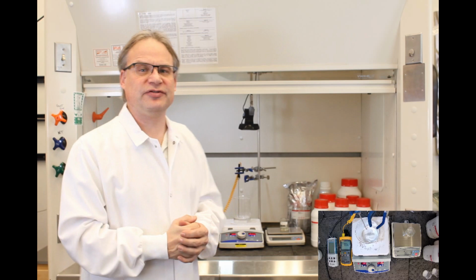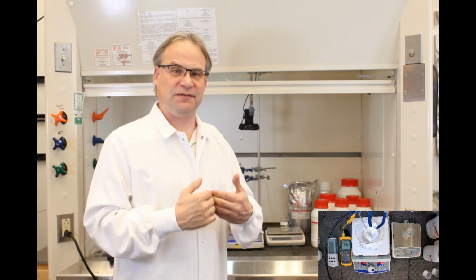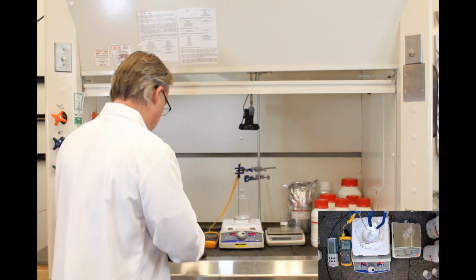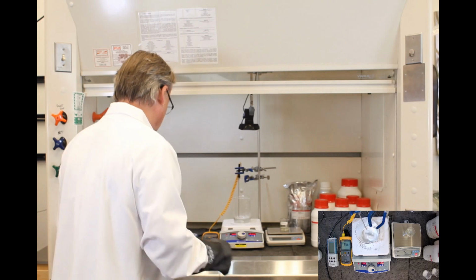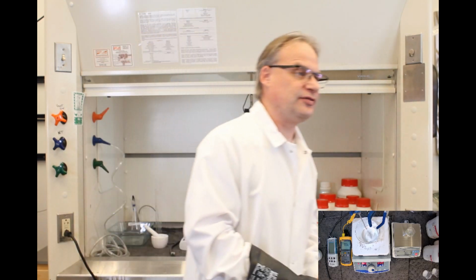I always suggest that you dissolve the acid first in whatever you're using. So in this case here, we're using vegetable glycerin. I'll put on my gloves and we'll go to the fume hood cam while I work with all these things.